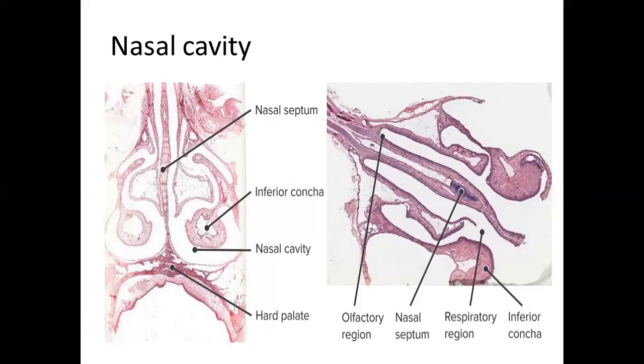The dermis of the vestibule houses numerous sebaceous and sweat glands. Also, the dermis is anchored by numerous collagen bundles to the perichondria of hyaline cartilage segments, which are the supporting skeleton of the wings or ala of this cartilage.